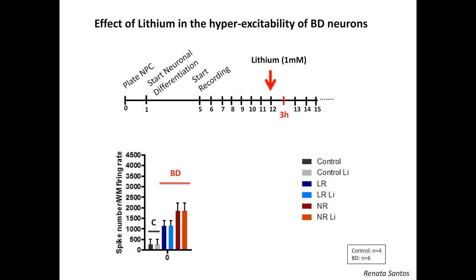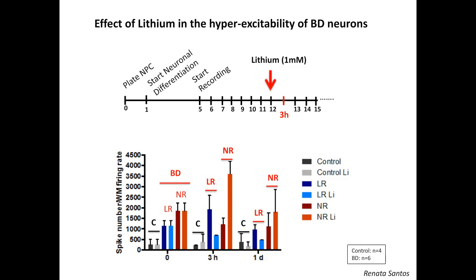We then did a time course after lithium treatment, and to our surprise, only 3 hours of lithium exposure was sufficient to decrease the number of spikes in lithium-responsive, but not in lithium non-responsive cells, as shown here in the bottom bar graph. The same effect was carried on after 24 hours of lithium treatment. We are currently investigating how long these effects will last, but nonetheless, our preliminary data indicate that MEA technology could be used to probe patient drug responsiveness.